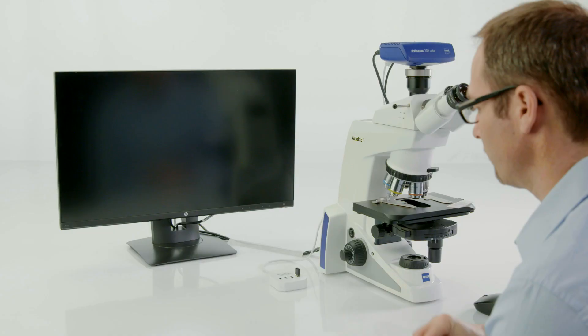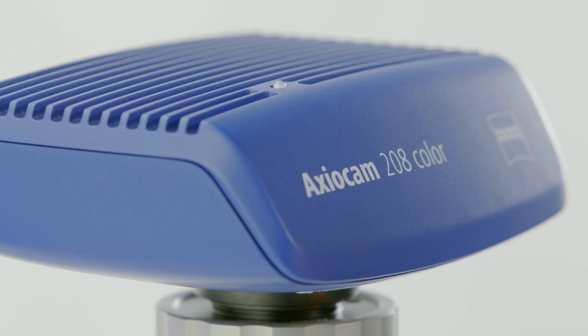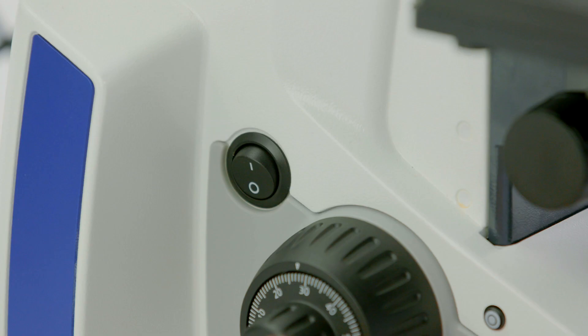Insert a USB stick into your Smart Axiocam 208 microscope camera. Switch on the microscope and place your sample on the stage.